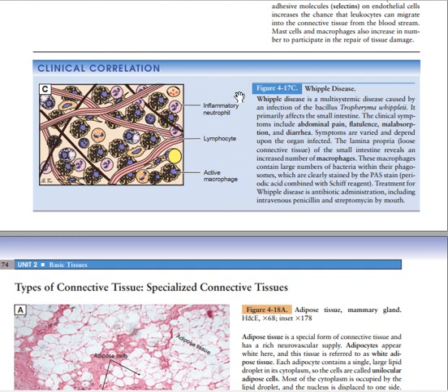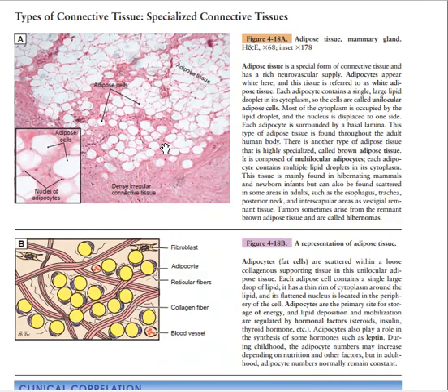This one is not typical of Whipple's disease; it just shows that there is an inflammation of the mucosa. To specify that it's Whipple's disease, you have to see the Whipplei organism inside the macrophages. You may see structures of this bacteria inside the macrophages.